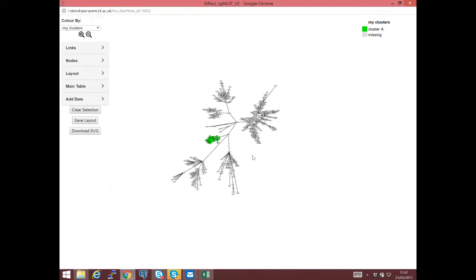We tried to pick loci for the cgMLST scheme that are not recombining. But as you continue to add more genomes, those new genomes may have regions of recombination, which we do not clean up. So you may have some of that recombinant signal in your cgMLST tree.